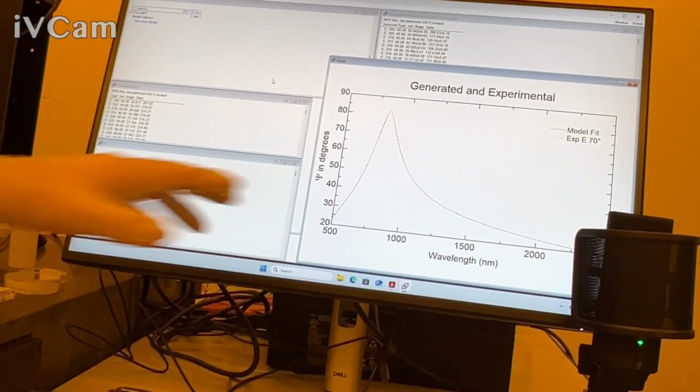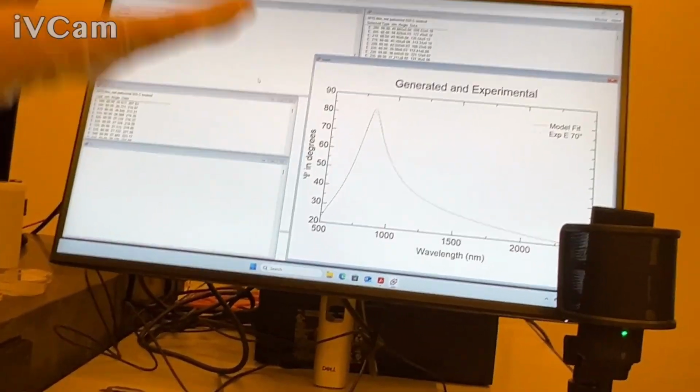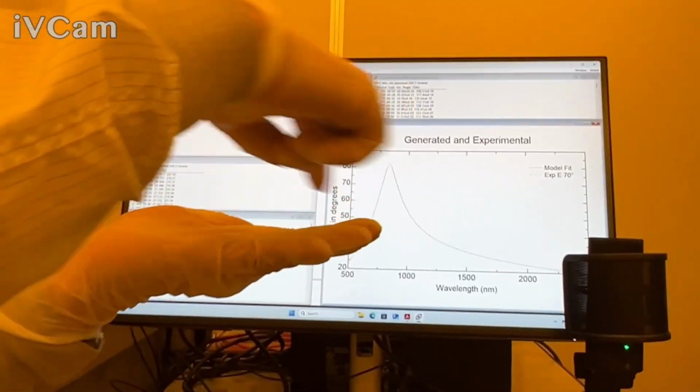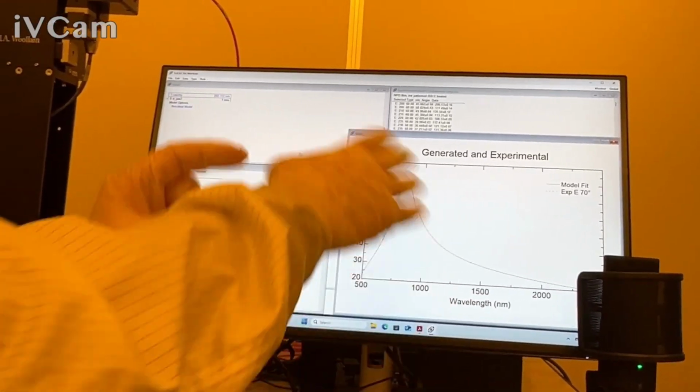So you can imagine this was the fit, or the assumption, that everything under the beam was uniform. It only has one thickness and one set of optical properties underneath the probed area. We measured a certain area. Everything is perfect. That's what it's predicting right now.